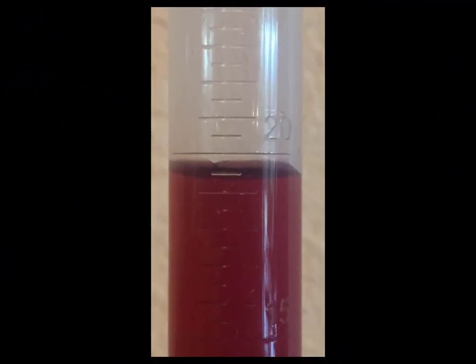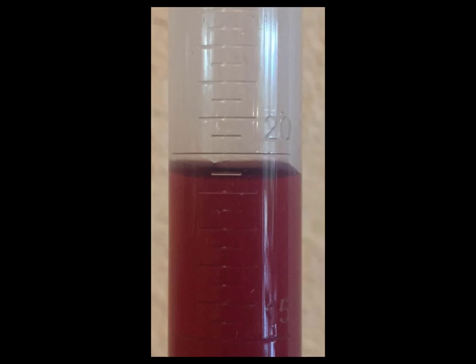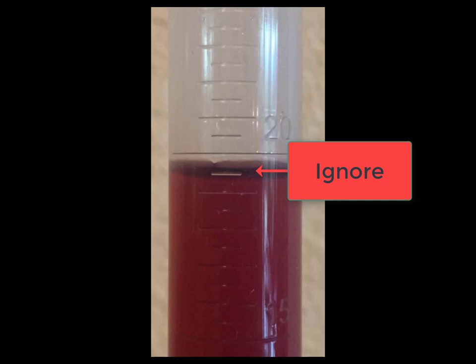In the case of the graduated cylinder, it appears that there are three levels of graduations, and the major graduations are not subdivided by 10, rather by 5.